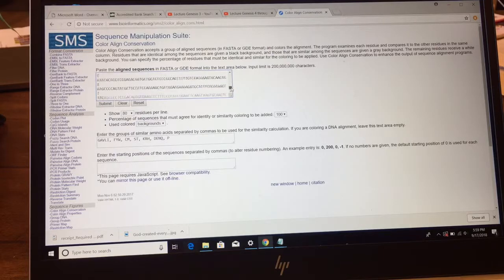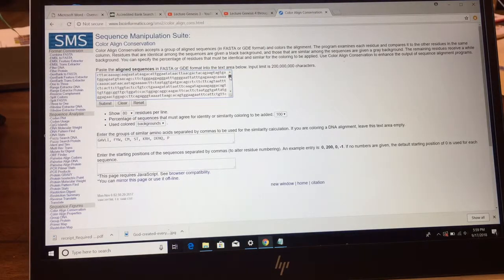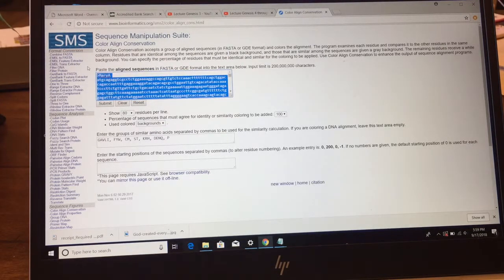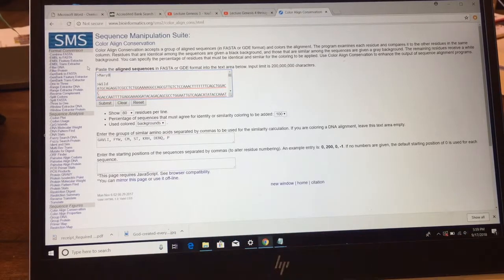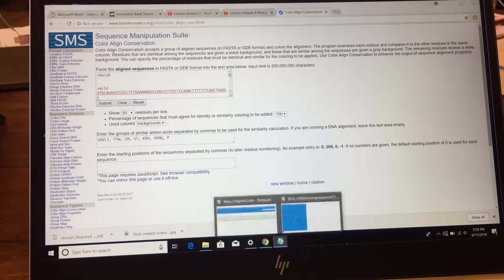On this page, what I ended up doing was leaving the wild type there. I scrolled and tried to find where Mary's A allele ended and my wild started, then went up and deleted all that. Okay, open alligator mouth, Mary B. Now I'm going to go back to my file.